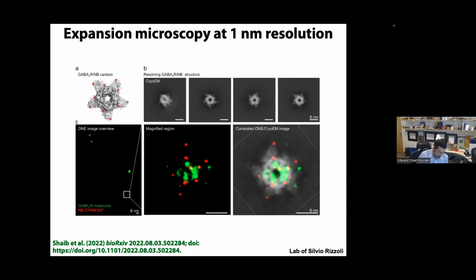So this is very exciting, the idea that this might be getting down to nearly atomic scale in the years to come. Meanwhile, JB Chang, the same JB that I mentioned earlier, who used to be a postdoc in my group, has a bioRxiv preprint on expanding the entire body, what he calls whole body expansion microscopy. They've shown that they can take the entire embryonic mouse, soften cartilage and bone, and expand the whole body. So it's interesting to see that expansion might be the first technique that goes all the way down to nearly atomic precision, but also all the way up to entire mammalian bodies.